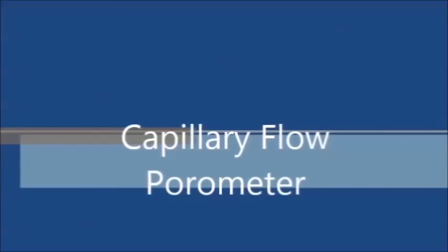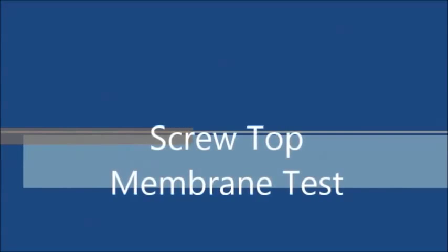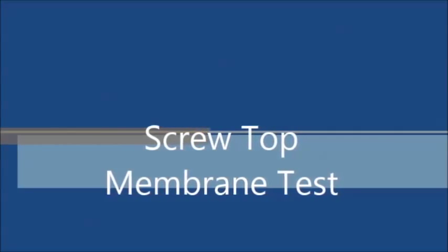Welcome to the PMI Capillary Flow Porometer demo. The first part is for a screw top sample chamber. We're going to do a membrane test.